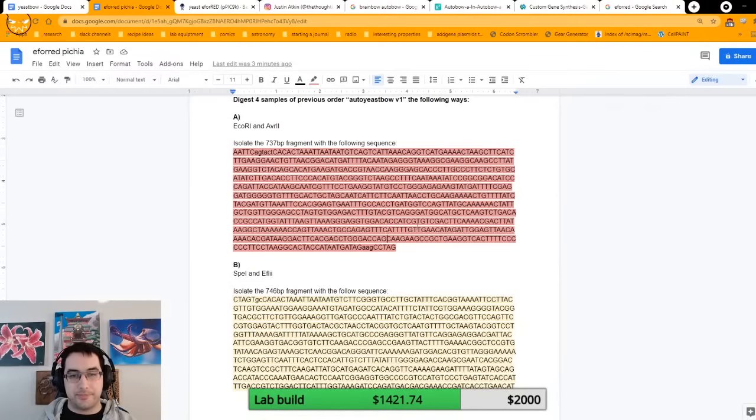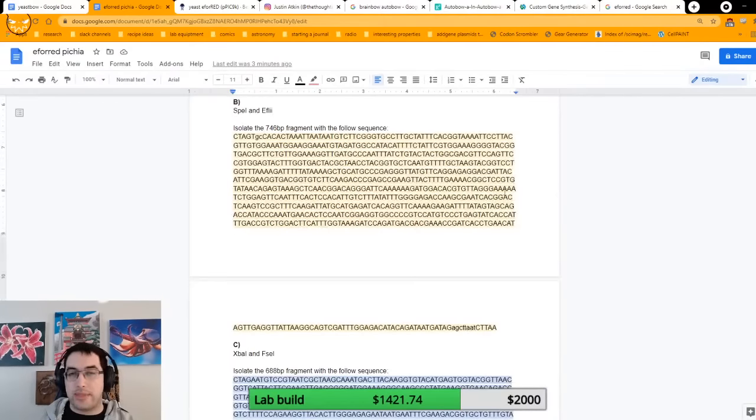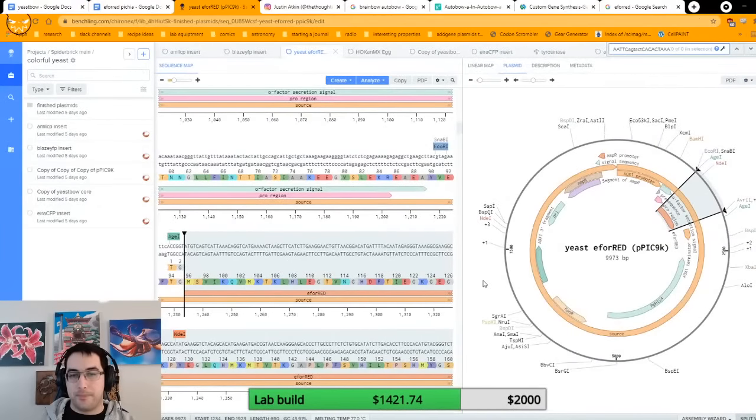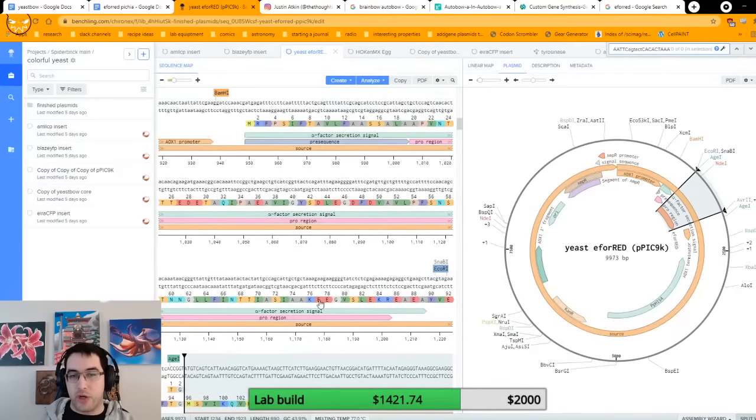So yeah, that's right. I'm going to have to go back in and figure out what I did. I think I probably added some extra letters at the front. The way this particular backbone works, if you don't want to mess with it too much, is it basically comes with a chunk of protein already being expressed by default.